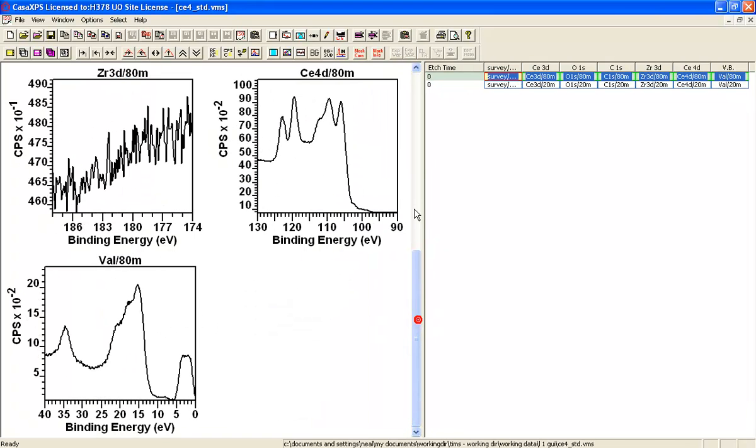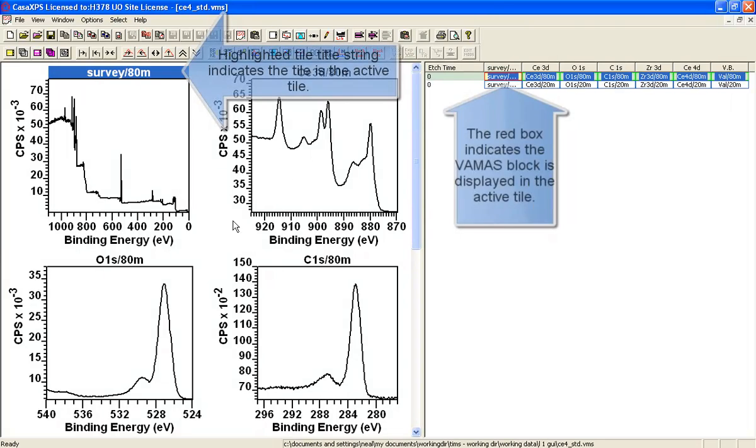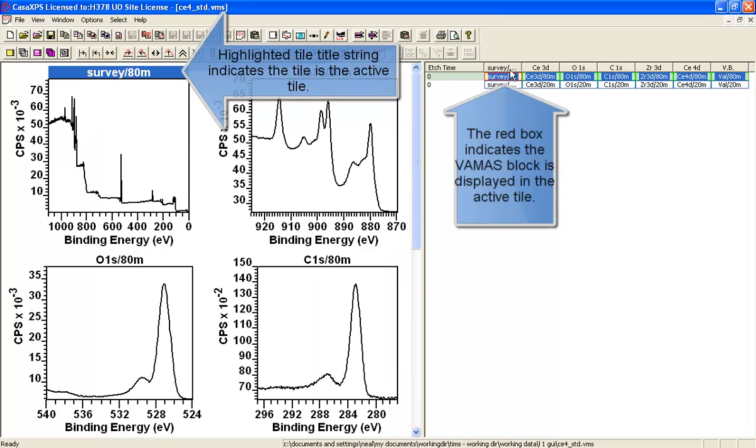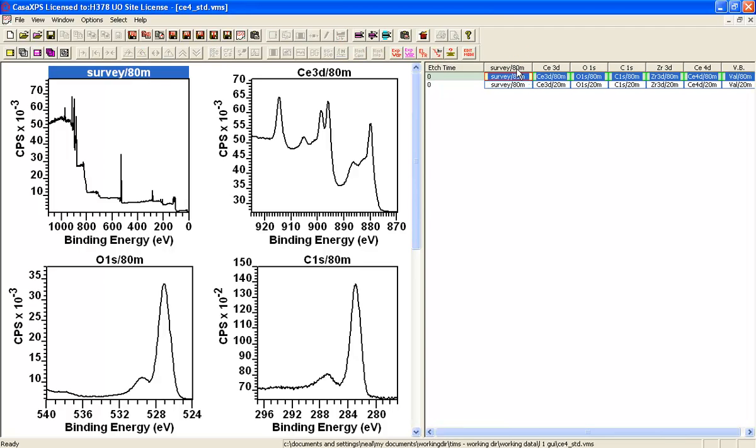We can now see that there is a blue bar associated with one of these tiles. This blue bar corresponds to the red border that surrounds the survey spectrum. As you can see, the survey/80m corresponds to the survey/80m here.